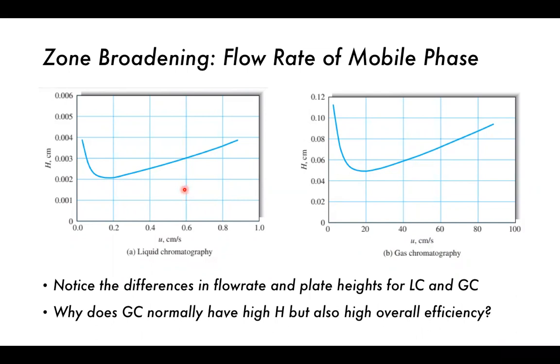It has better resolution, better flow rate, better output rate, but sometimes you can't get both at the same time. In liquid chromatography, it's very difficult to get this kind of efficiency because the flow rates here are too slow, and the flow rates are usually much, much faster than this, which results in a reduction in the efficiency of our column.